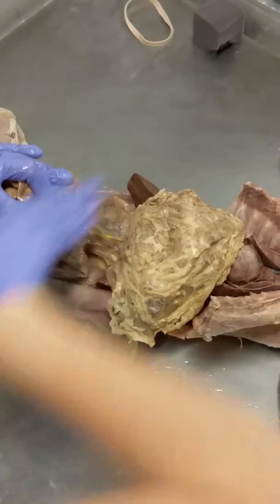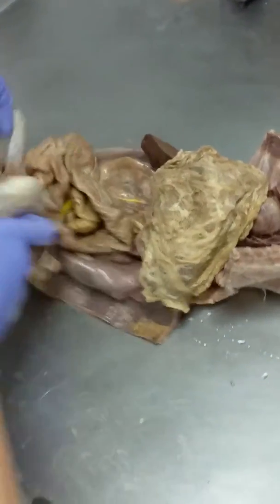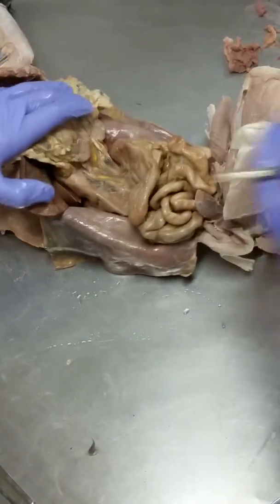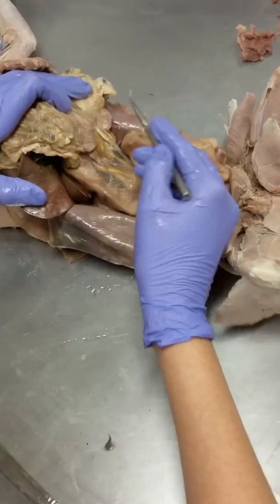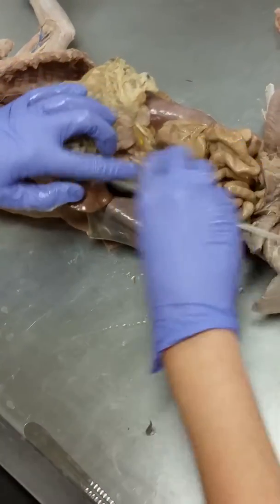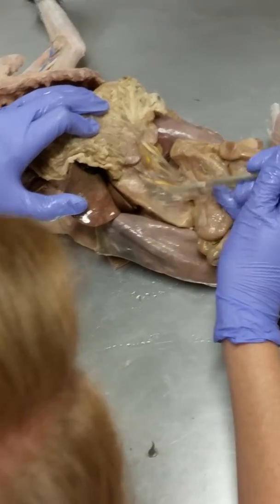In humans, it's tucked right up into the duodenum. Okay. If I turn this around, there's this thing here running under the greater omentum and then along the duodenum right there. So it's this thing right here. That's pancreas.